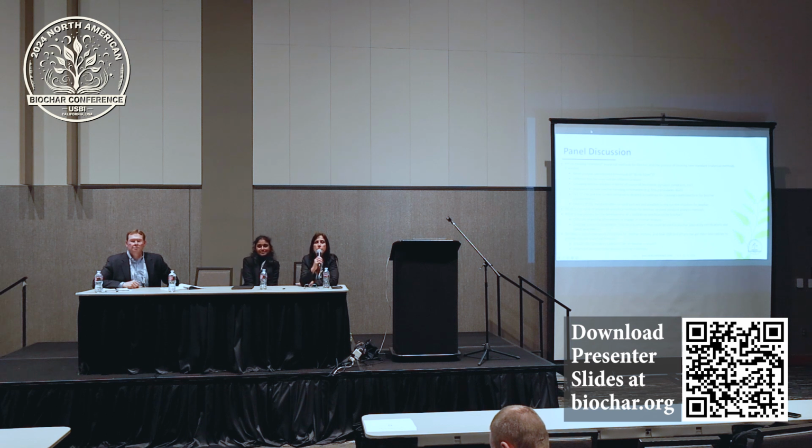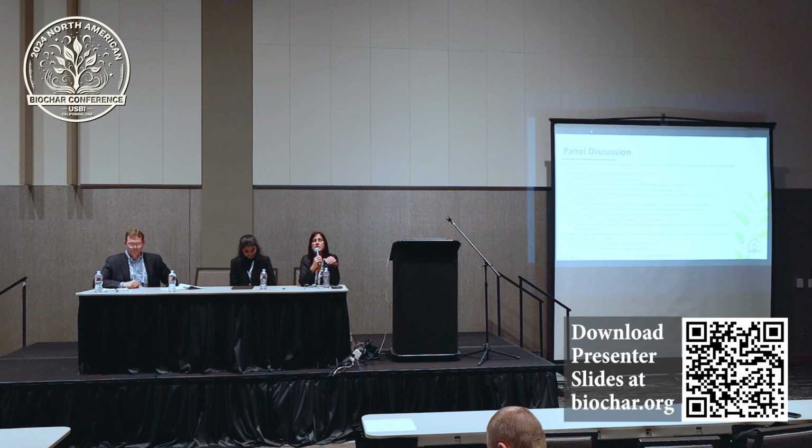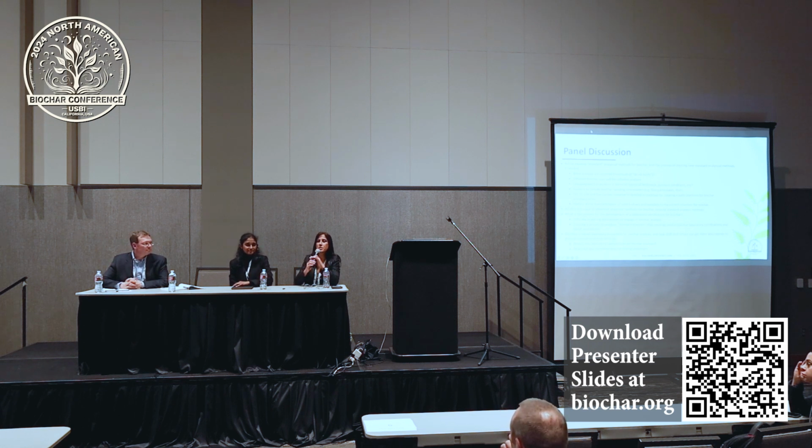Yeah, going back to that ultimate analysis where you can calculate the CHNOS and calculate the molar ratios to get to that value. The quantities of sample are minuscule. So what I would say is we would have to start with a large sample size, grind it to the level that has to be ground, dry it, and probably do at least 5 reps on that one, at least. And yeah, it's hard. And that's probably why you got different results.